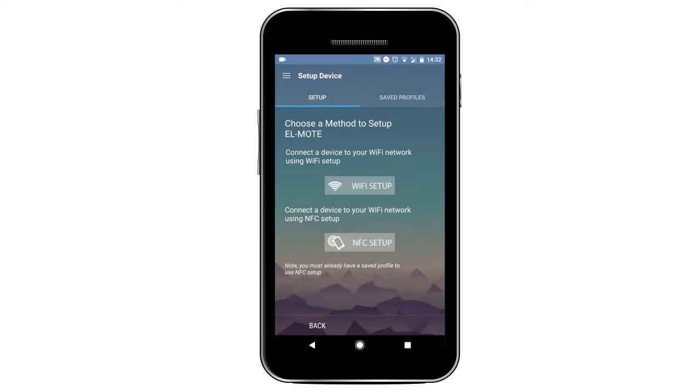You can decide whether to set it up via Wi-Fi or NFC. Please note that for the first setup of a device, a Wi-Fi setup must be used. All subsequent setups can be done using the NFC option once a profile has been saved.